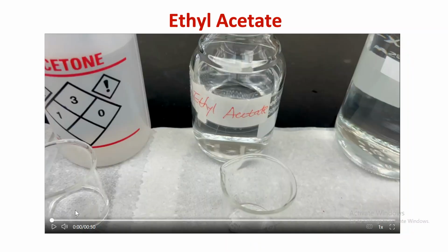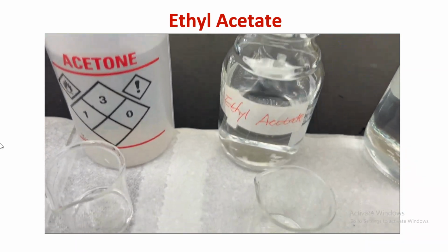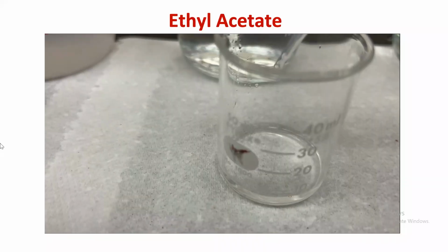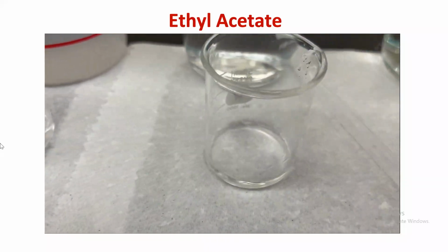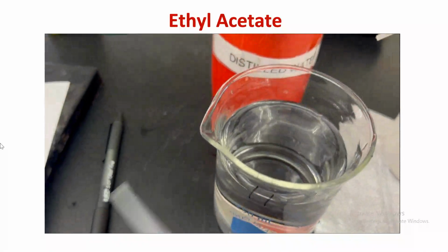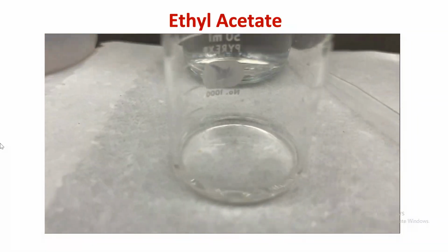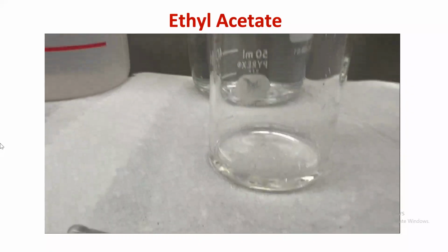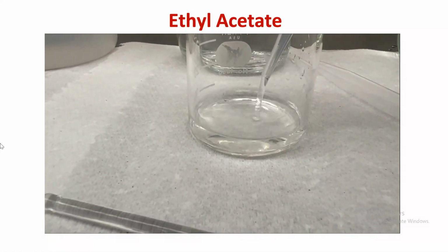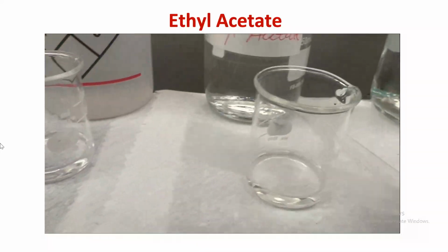All right, now we're up to ethyl acetate. Now we might be wondering, is it going to be similar to water or different? So we'll be adding some ethyl acetate, closing the container, going back to our water, adding water. And I want you to notice this time. This time will be a little different. Let's stir it up.